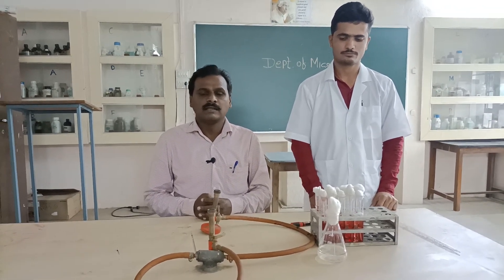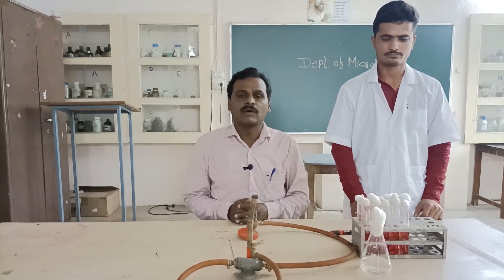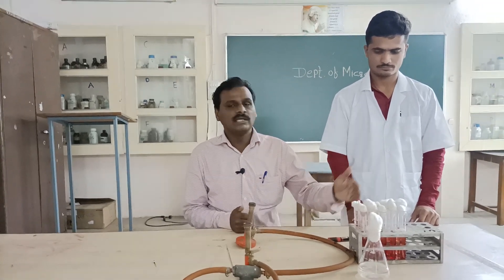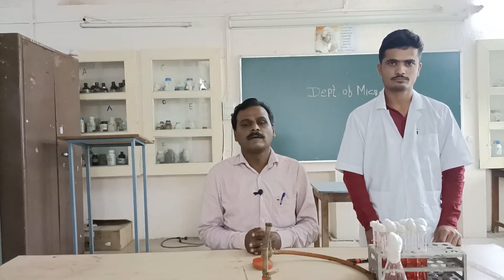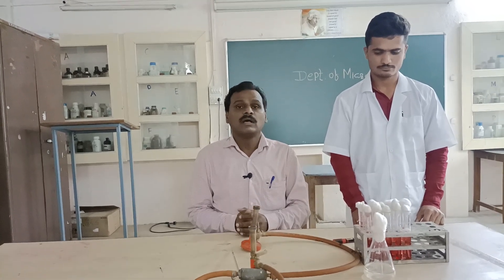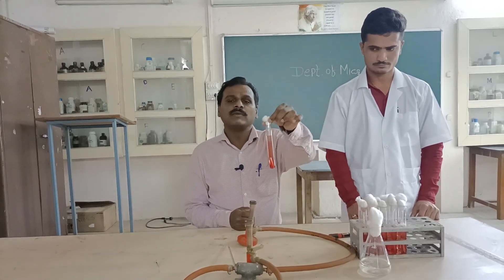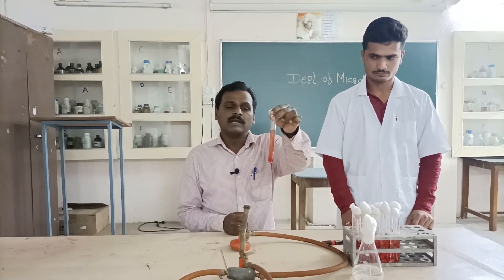After inoculation, all 15 test tubes are incubated at 37 degrees Celsius for 24 hours. After incubation, we compare the number of positive test tubes in each row with the standard MPN chart. We observe the test tubes for acid and gas production: a change in color of the medium indicates acid production, and formation of bubbles in the Durham's tubes indicates gas production.